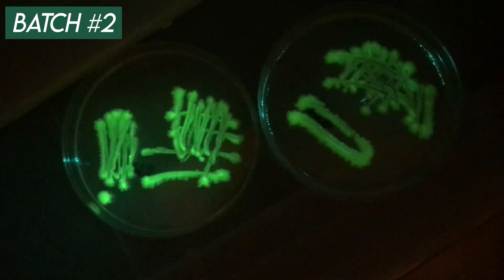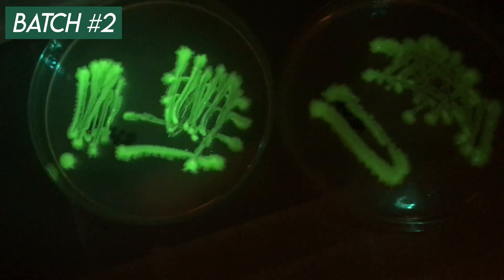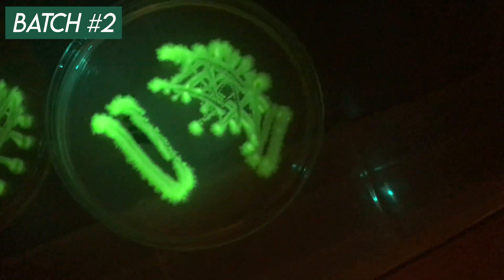Oh, that looks pretty good there! Half of my experiment looks like it didn't work, but these two that I redid look like they did. This experiment has been a heap of fun. I love this stuff and I love what The Odin is doing by promoting biohacking and experimentation with science — that's a great ethos I can get behind. I'm very much looking forward to the next kit from them that I try out.